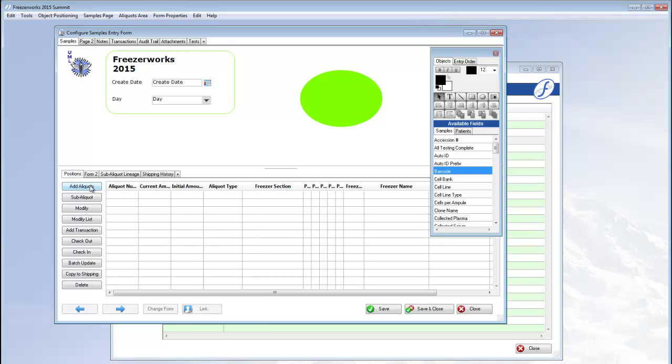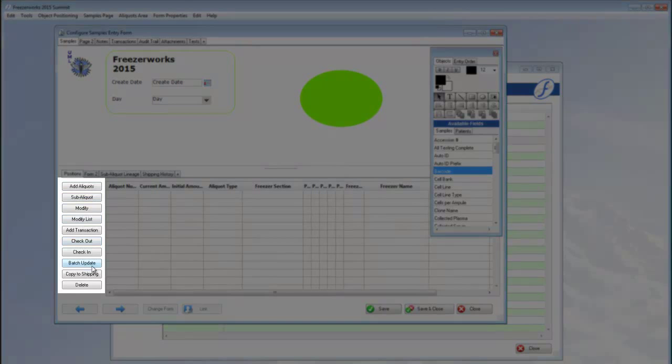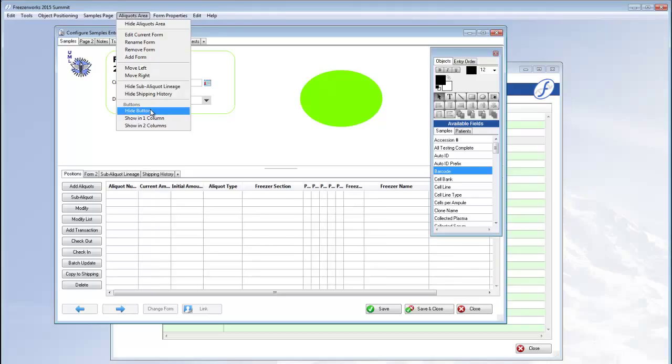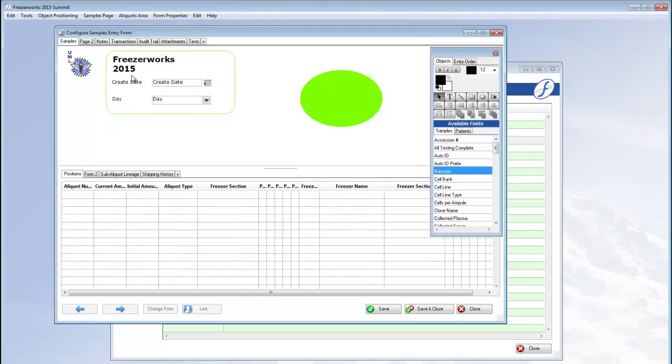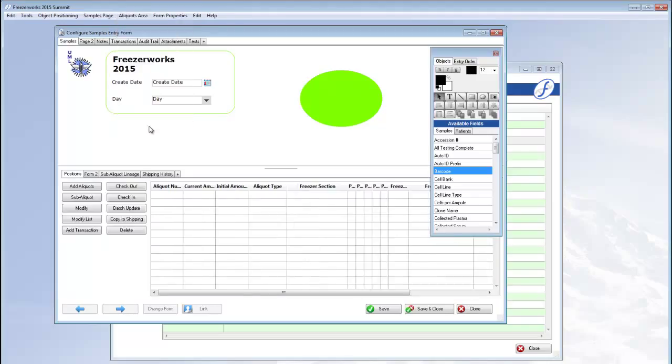Lastly, the action buttons to the left of the aliquots area can be edited. In the aliquots area menu, you can hide the buttons altogether, or just to create some space, change the organization to two columns.